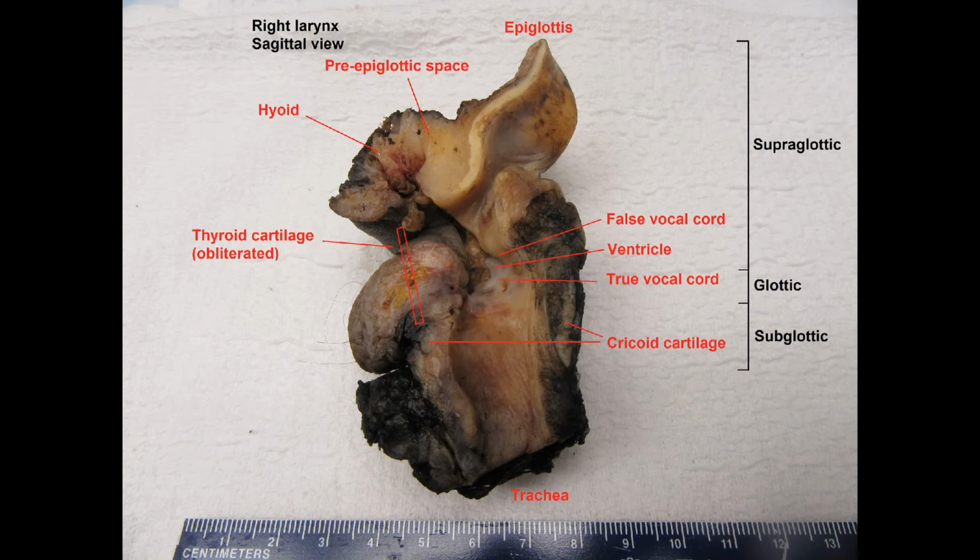Sometimes you'll find little cysts, or you might even find a little bit of early dysplasia. So a lot of places will routinely give you a midline section of the epiglottis just above the anterior commissure. I don't necessarily care one way or the other, unless it clearly is involved with the tumor, and I'm not going to go back and ask anyone to sample it.